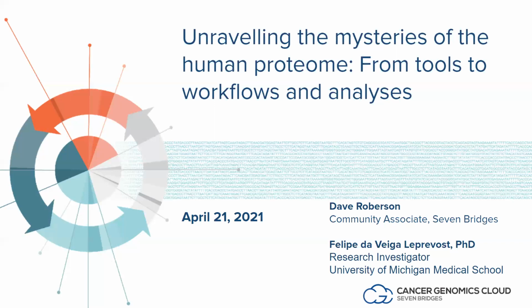So today we are here to learn about how to use the features of the CGC to perform proteomics analysis using data from the Proteomics Data Commons, or the PDC.